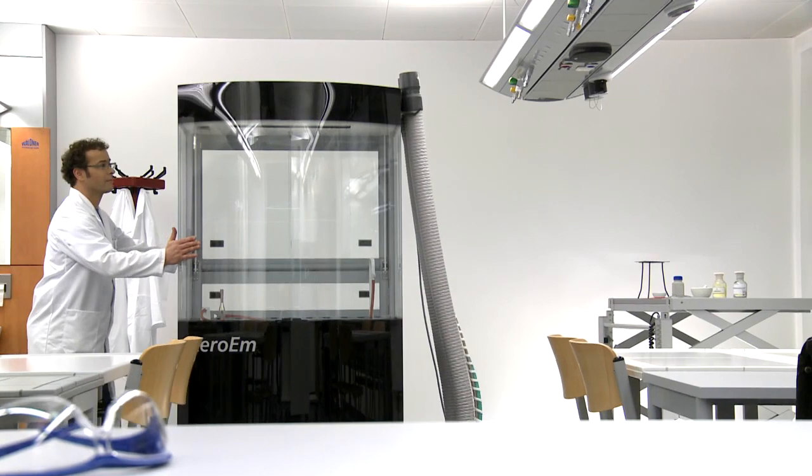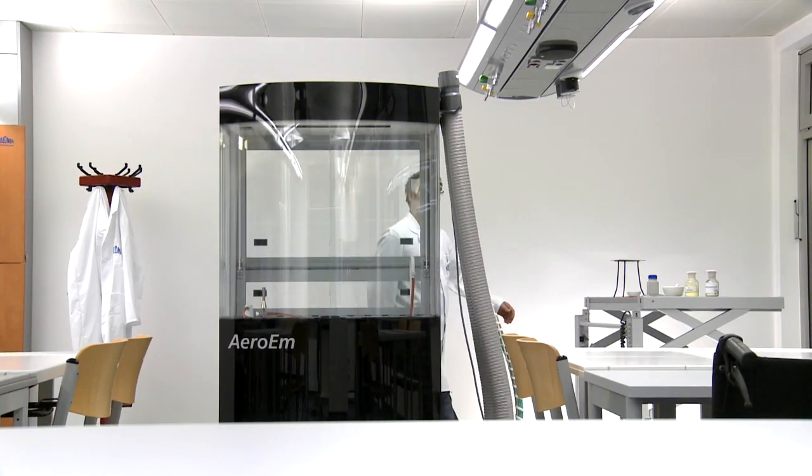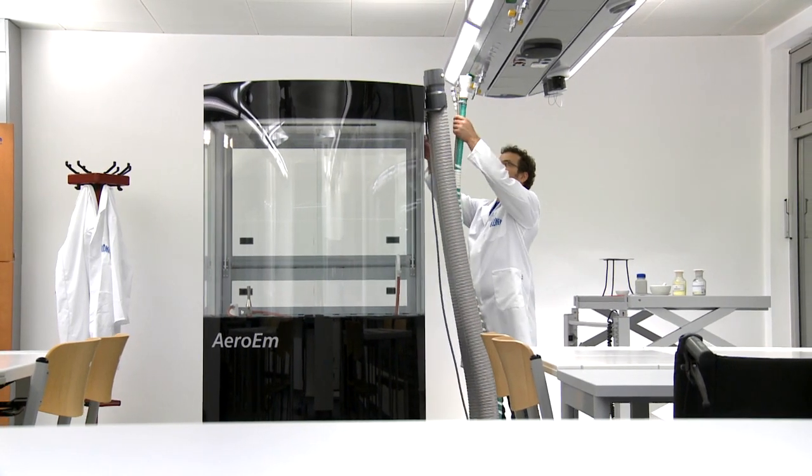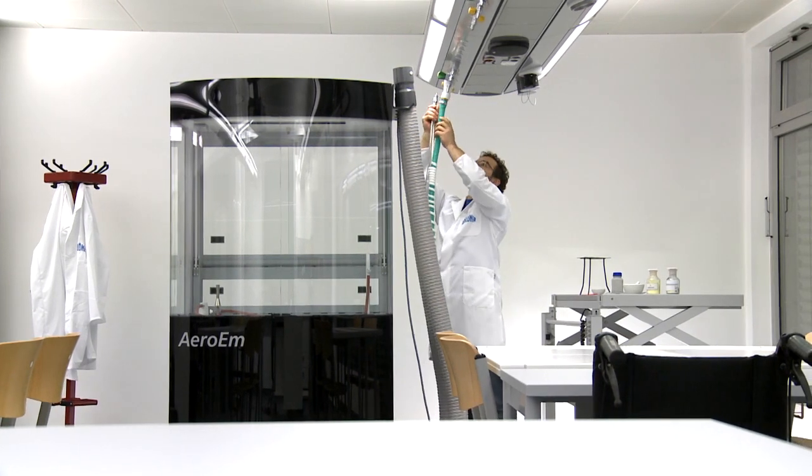The Aero EM from the Scala modular system is a full-feature mobile fume cupboard, which complies with all the requirements of the DIN EN 14175 standard.